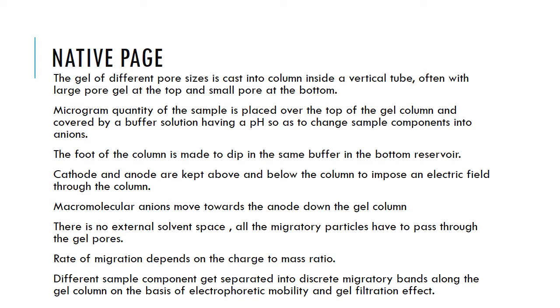Okay, let's talk a bit about native PAGE electrophoresis. In native PAGE, the gel has different pore sizes that are cast into the column inside vertical tubes. That's the diagram we had drawn earlier.